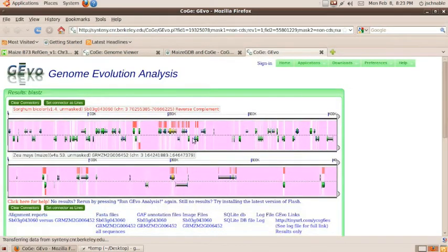Now it's loaded. Now there's several things to notice here. First of all, the yellow is the gene that we actually selected in both organisms. The green genes are other genes in the same region. I've just shift-clicked on the various BLASTZ hits so you can see how the homologous genes are distributed in the two regions. Over there you can see there's a little inversion.